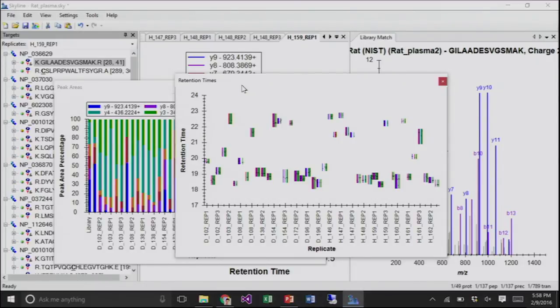So yeah, in this case, we chose 109 proteins, right? I didn't actually do this, but I suspect that the person who did this, there are a number of ways that you could do that. You could create a collection of accession numbers, and then you could go to, if you had a background proteome. Have you guys set up a background proteome? Yes. Okay, so if you had a background proteome and you had a list of accession numbers, then you could go into edit, insert proteins, and you could paste in your list of accession numbers, and Skyline would just find those in your background proteome. You could also just paste in the list of names, and that's one way.